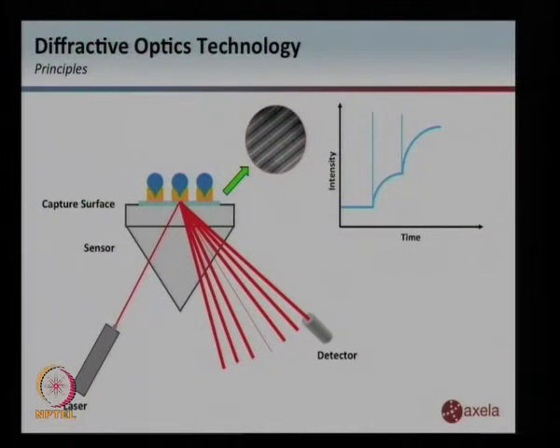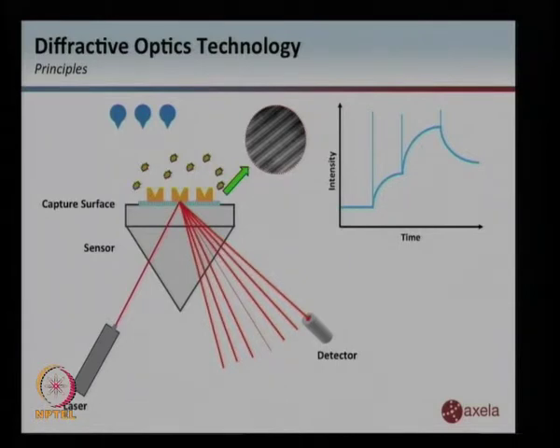So you can imagine an antigen and an antibody and a secondary antibody. You can also play games. If you're into trying to measure relative strengths of interaction, you can imagine whether you can displace this antibody with another thing. So here's something coming in, another molecule, and if the binding is stronger, it may actually detach the previous one, and that will be indicated by a change in signal, in this case, a decrease in signal.